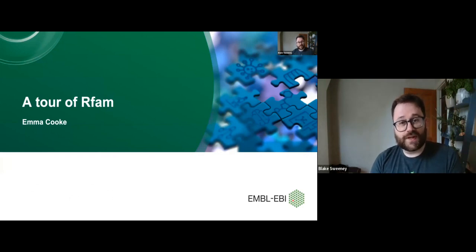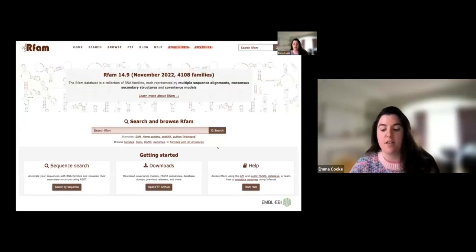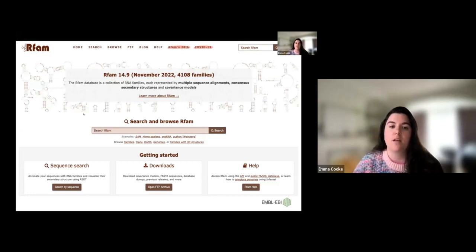So with that, I will switch over to Emma, who will give you guys a tour of what's in Rfam and how to get it. Thanks. So I am going to take us on a whistle-stop tour of the Rfam website. Once you navigate as far as rfam.org, you'll be greeted with our homepage. The main message on our homepage is our most recent release, the date, and number of families. At the top of the page are quick links to the most useful parts of the website. At the bottom, you can see our Getting Started section of useful links to get you going with the Rfam website.